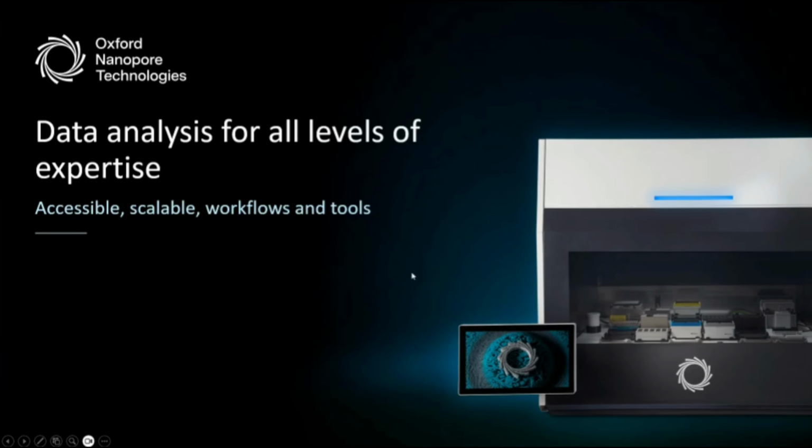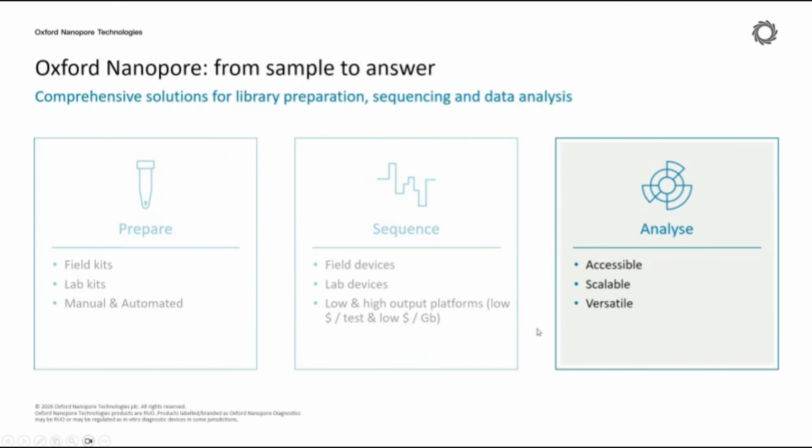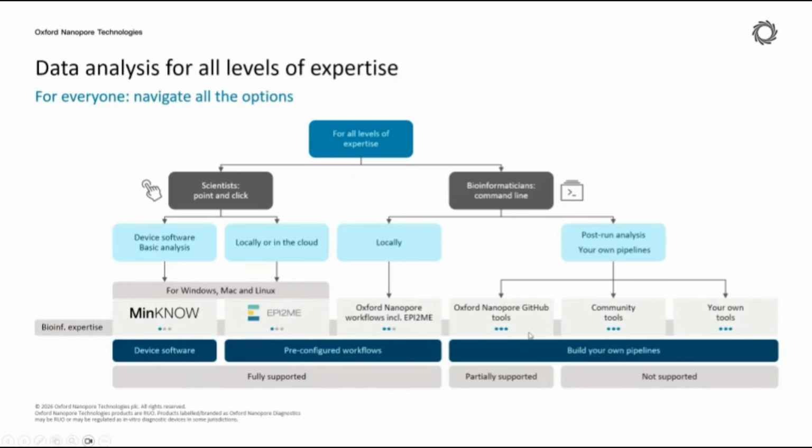The data analysis is our focus for today. To handle Oxford Nanopore sequencing data, ONT has prepared some solutions for data handling and analysis. For nanopore sequencing users, ONT provides two different software: one is called MinKNOW and the other is called EPI2ME.